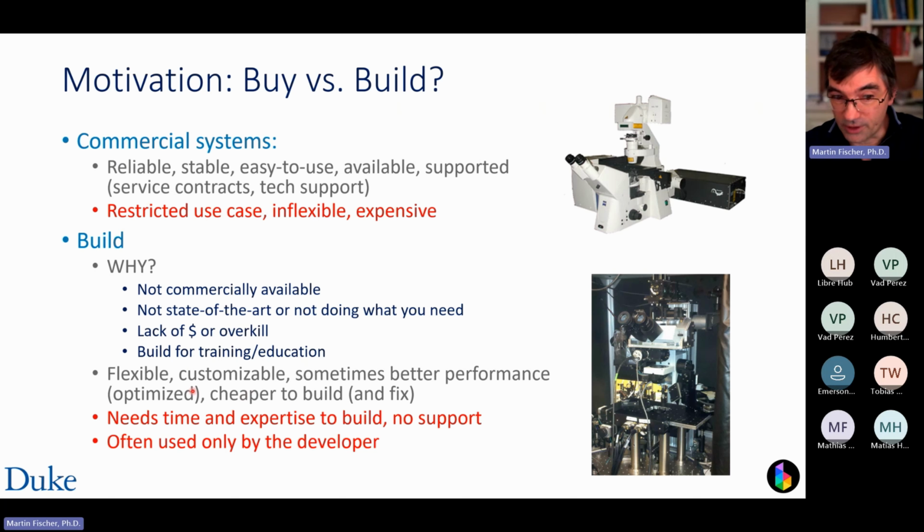If you build it yourself, they're extremely flexible. You can modify anything you like. Most of the time, if you custom design it, you can get better performance than if you buy one off the shelf that does many things, but not as well as each individual one. And of course, they can be a lot cheaper, not only to build, but also to maintain.